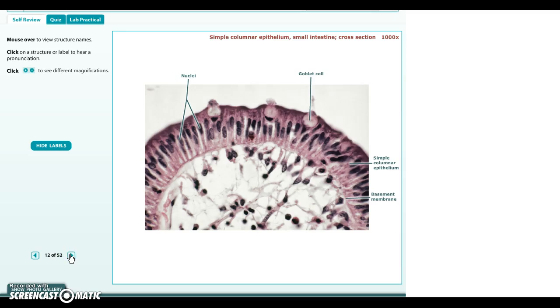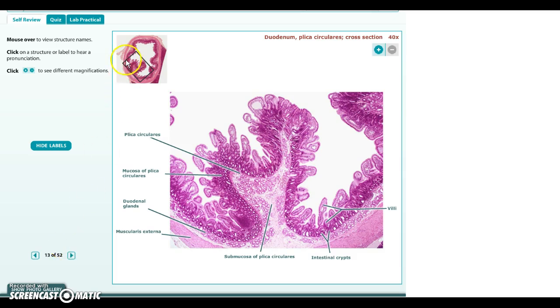to the intestines. So on the intestines, we saw these in A and P1 as the great example of a columnar epithelium on the surface of the small intestines, with those goblet cells up there and the simple columnar cells in the epithelial lining. Remember, the intestines are also going to have those folds on them. They're going to have villi sticking out, and that's where you're going to see the simple columnar epithelium on the surface of the villi.